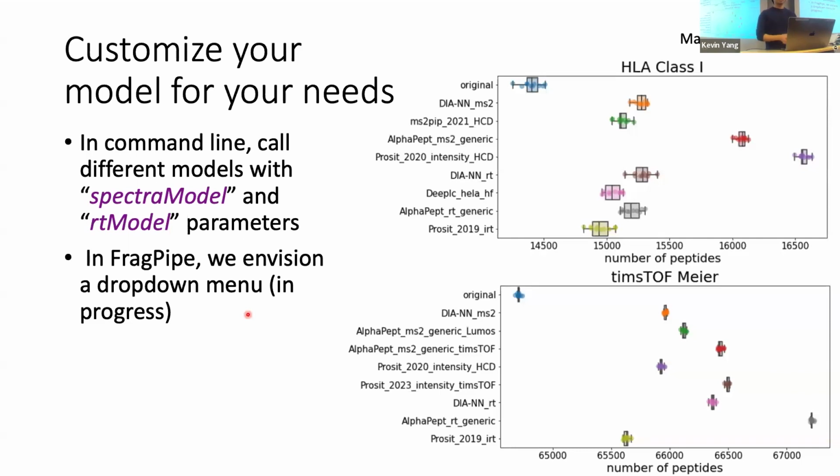But that is a good point. Sometimes you get suboptimal things because there are just a lot of parameters to calibrate with these things. So it's not always going to be good. But even that being said, we've done predictions for these TMT tags, which change the spectra a lot. And while you see that the predictions are suboptimal, it's still good enough that you get a smaller boost, which again brings up the question of false positives. But yeah, you have to optimize things, but even if they're suboptimal, they provide some benefit.